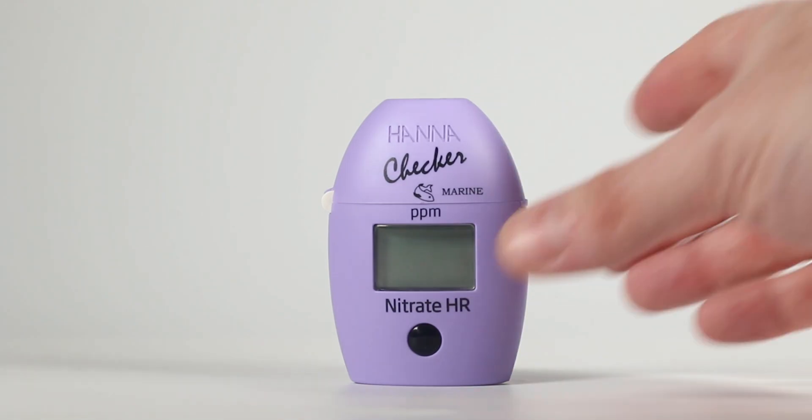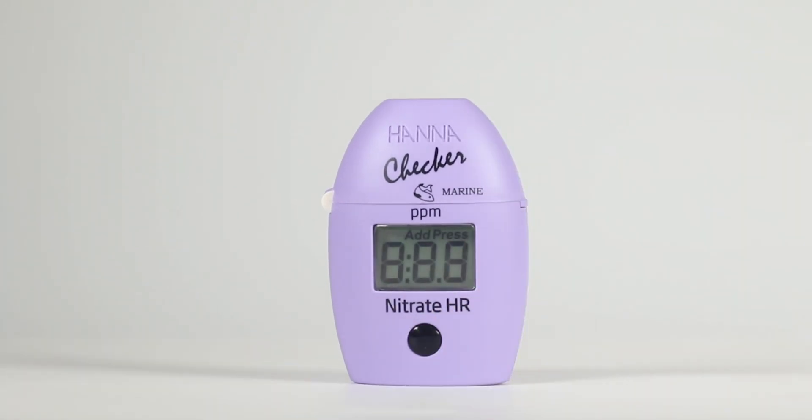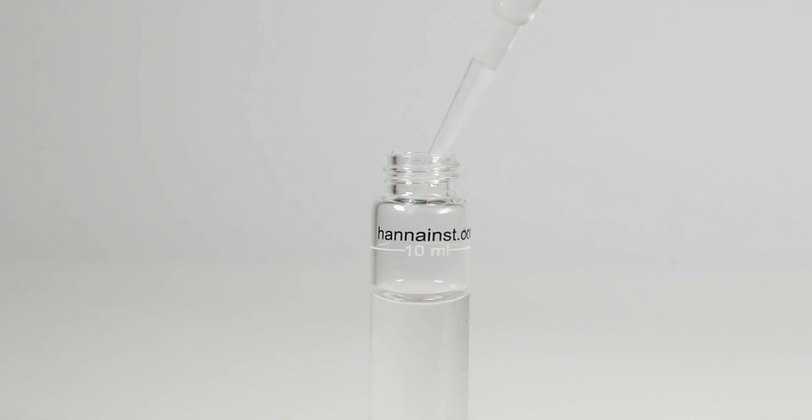Let's take a measurement. Press the on-off button to turn the checker on. All segments will be displayed for a few seconds, followed by 'add C1' with 'press' blinking. Fill the cuvette with 10 milliliters of unreacted sample and replace the cap.